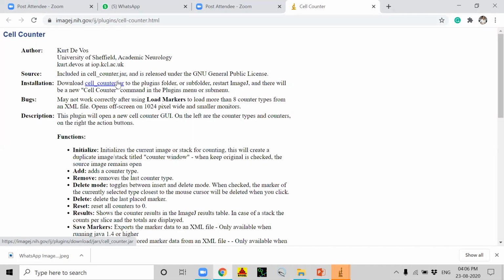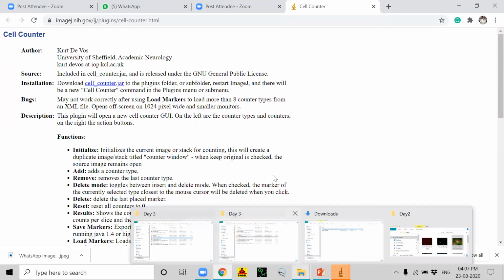So now, I have downloaded it, let me show.